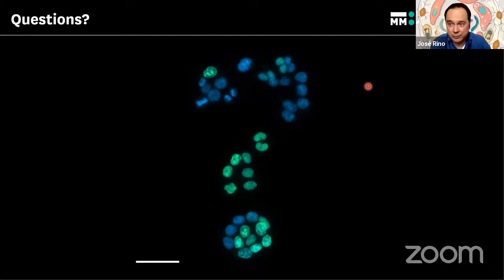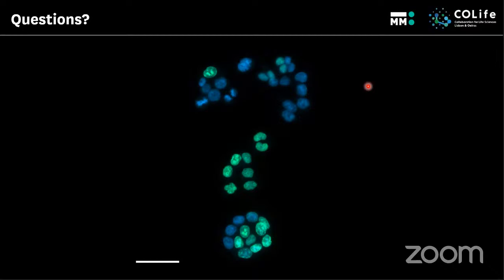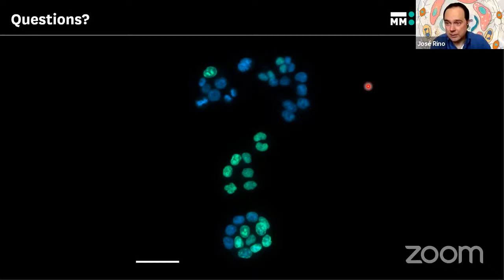So we are basically acquiring just a few photons, and what looks like a noisy image is because of the contrast enhancement that we are making. We're amplifying the signal to get the dynamics and the speed of it. It would basically be impossible to acquire on the point scanning. But remember the triangle of compromise: you cannot have it all. Because you wanted speed and sensitivity there, resolution was compromised for the sake of speed of acquisition.